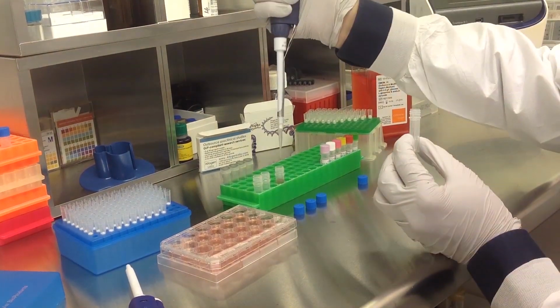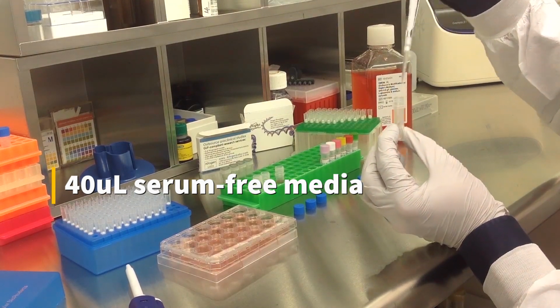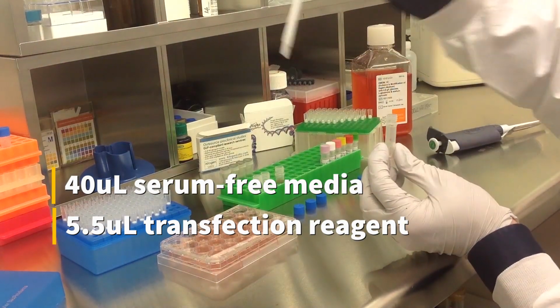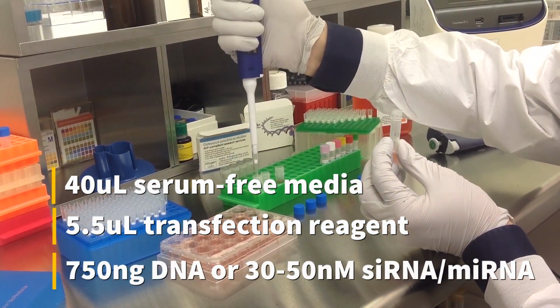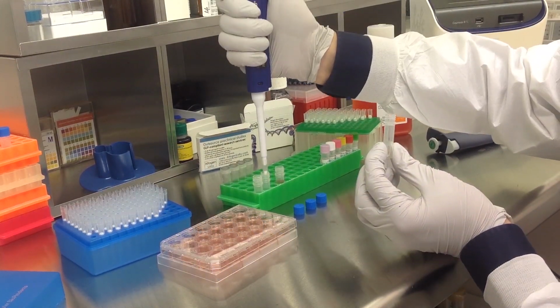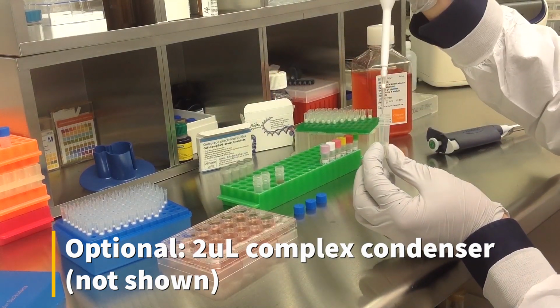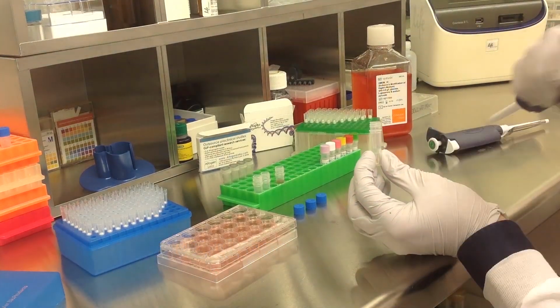To prepare transfection complex, mix 40 microliters of serum-free medium, 5.5 microliters of transfection reagent, and either 750 nanogram of DNA or 30 to 50 nanomolar siRNA or microRNA. An optional step is to add 2 microliters of complex condenser, which increases transfection efficiency, but may also increase cytotoxicity.